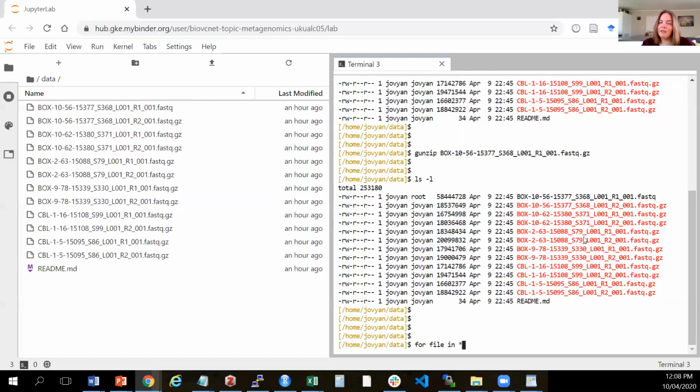What that's saying is that I don't mind what comes before the match as long as you pick up everything that matches this particular information. I don't mind what comes before, but I do care about the .fastq.gz part.